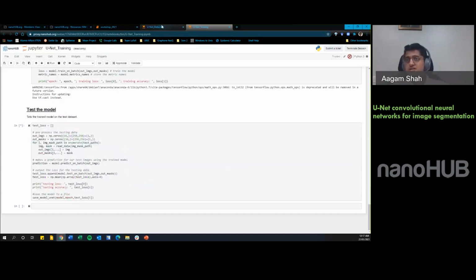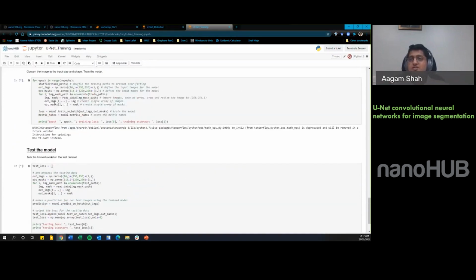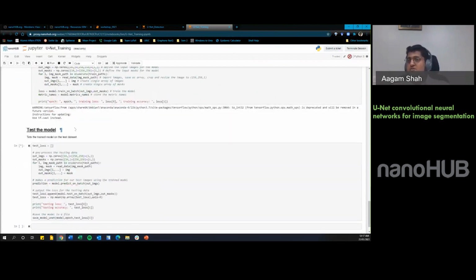So normally this training right here takes about 8 minutes for me. What I see here, and this happens quite often, is that when a lot of users are on NanoHub using the same tool, it takes quite a bit longer. So last workshop we had a fitting that normally took 1 minute, and it took 3 minutes in the workshop. But yeah, there are no images or any output here per se.